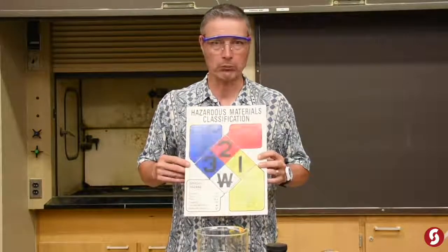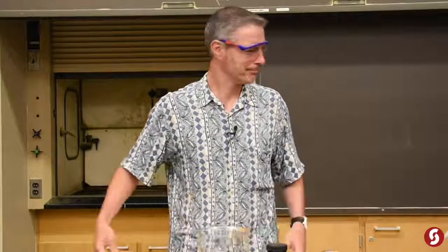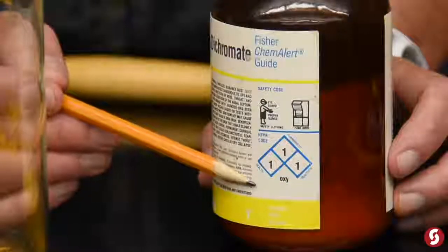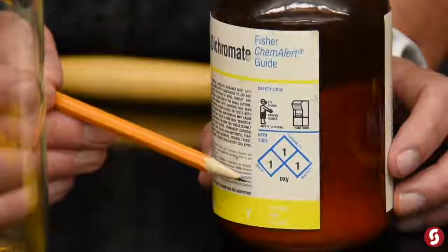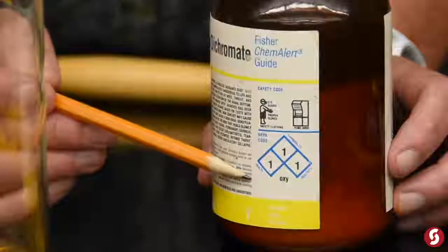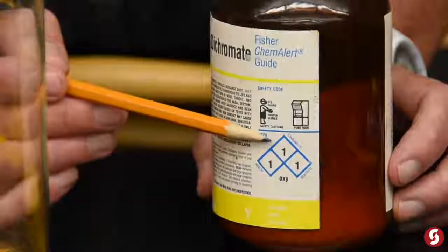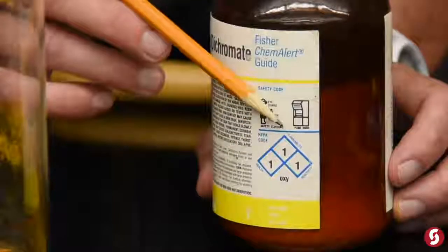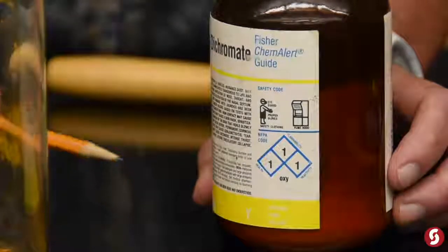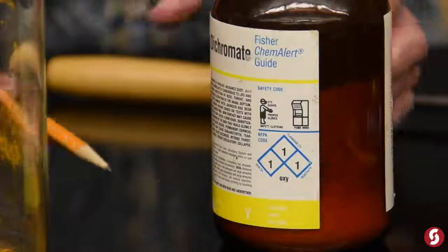Not that animals aren't welcome to watch — it's just that they can't read. Okay, so if we look at the NFPA label for ammonium dichromate, it's got three ones. It goes from zero, meaning no hazard, to four, meaning very hazardous. It's a one for health because chromium is a suspected carcinogen, so I'm not going to go eating or breathing much of it. For fire, when I apply heat it will decompose, and for reactivity, if you apply enough heat it'll decompose and oxidize other things including the nitrogen in the ammonium. So let's go do the reaction now in the fume hood, because there are ones there.